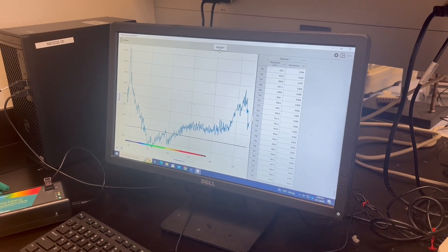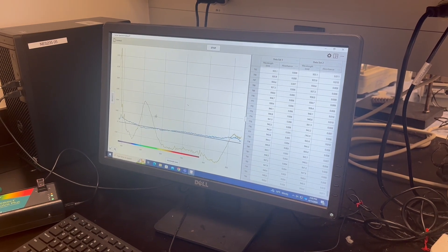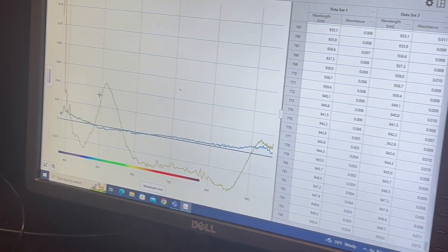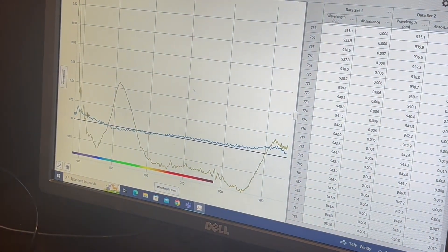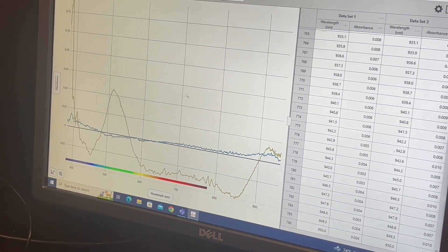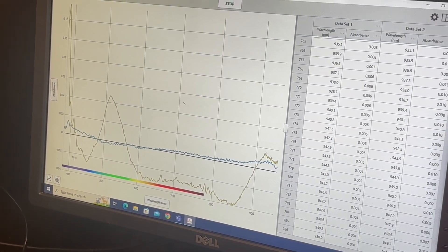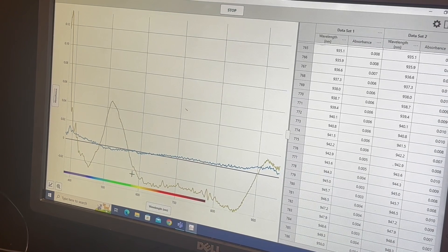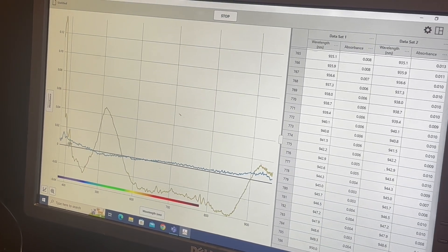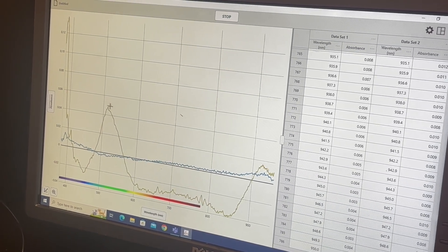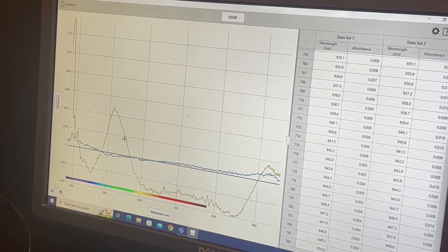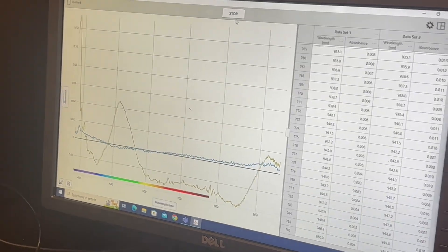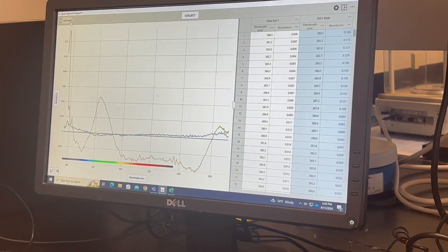Now you can go to collect. And you should see... I mean, this is a little bit lower of a baseline than I'd like to see. But you still see your lambda max in the right place. So once you have this data, you can stop.